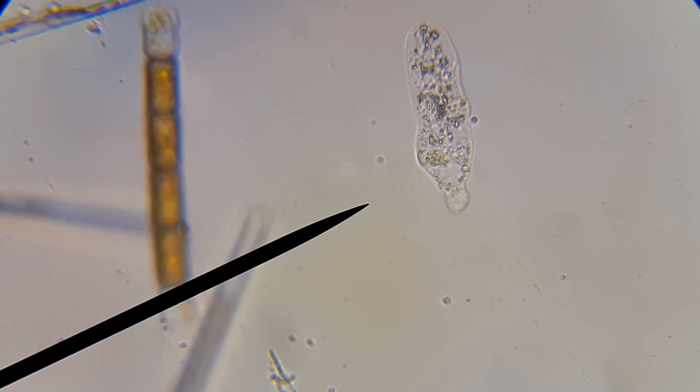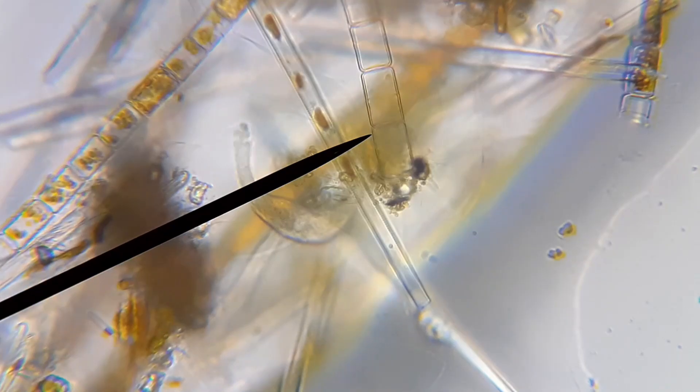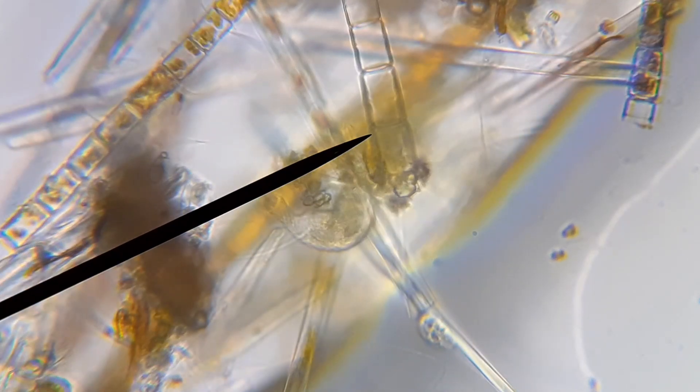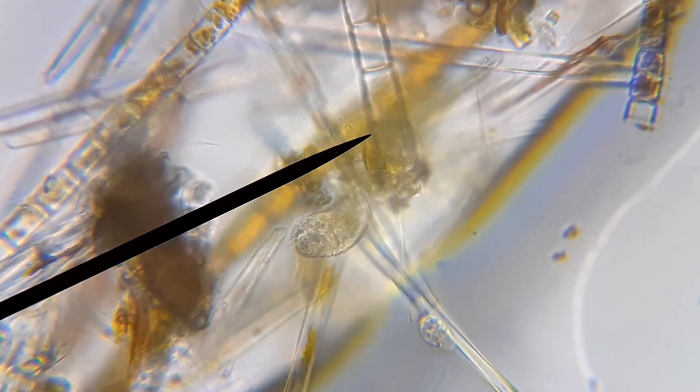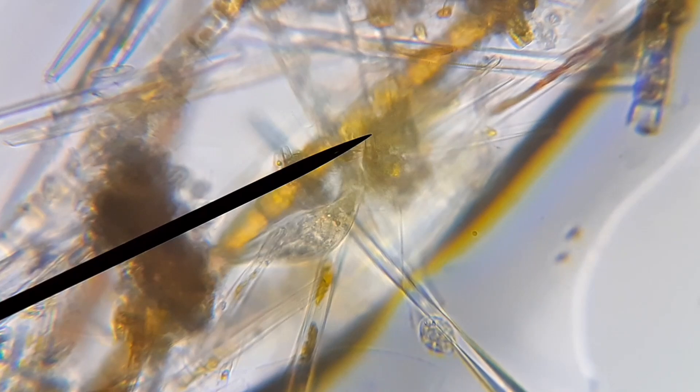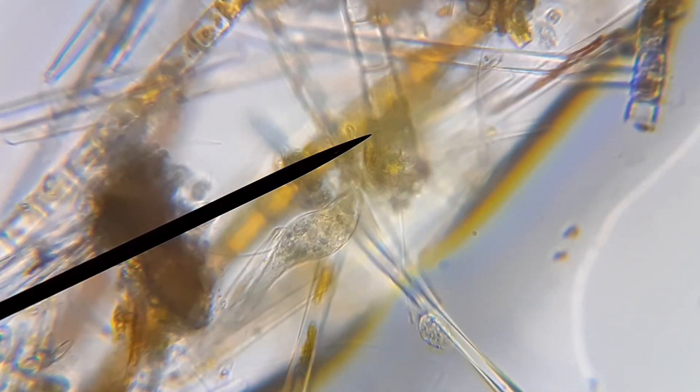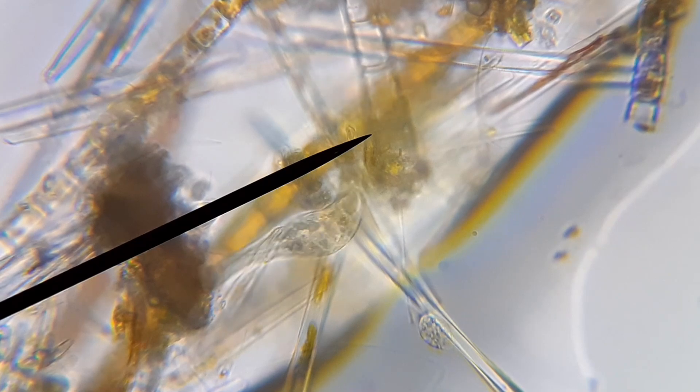Lacrimaria, that is the name of this ciliate. It's a very long neck and it's hunting for food. All of the other things that you see in the background, these are algae of course.